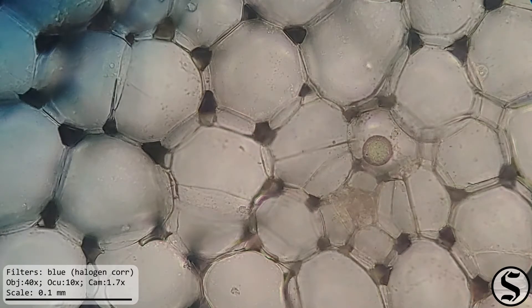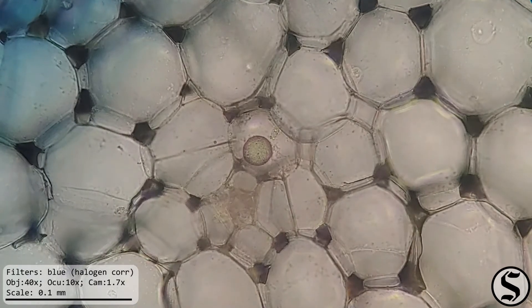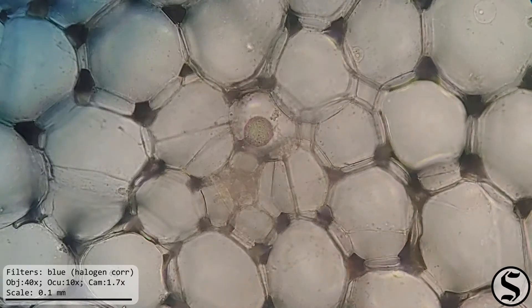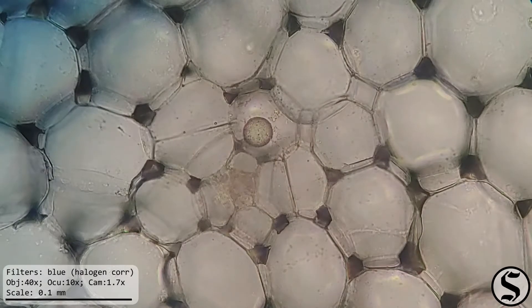And then I thought this was interesting if you recall from my carrot expedition I also found one of these there. I think it's maybe some entrapped piece of pollen or something. Not really sure but it's interesting.